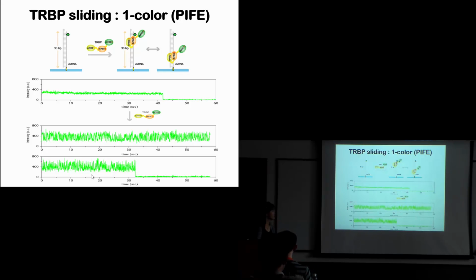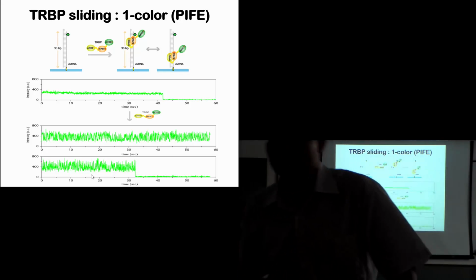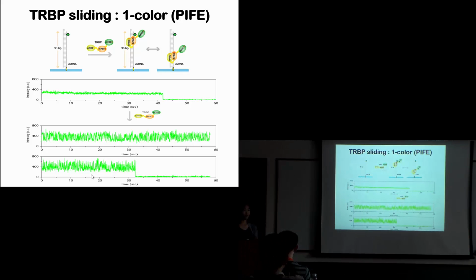Yeah, so our exposure time used for this assay is about 50 to 100 milliseconds. So we're not detecting anything at a microsecond level or anything like that. So that's about the level. And this movement is about 800 milliseconds or so, one cycle of going back and forth. So it's measurable.